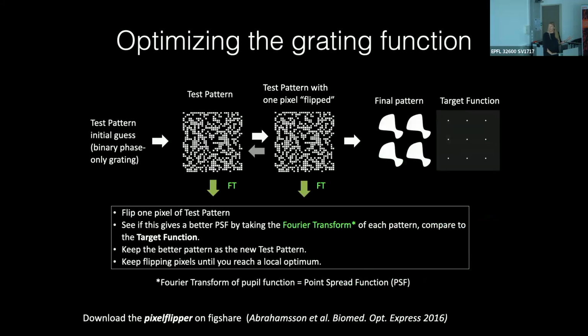The grating function here looks like that little goblet or little fan. People call it different things. It's made by the algorithm that I wrote. It's probably the worst code you've ever seen in your life. It's written in MATLAB by a grad student who doesn't like programming. So it took actually 5 days to run on my old plastic Mac laptop. It's much faster now that my student has rewritten it in vectorized form without for loops in MATLAB. I recommend doing that, but it really works quite nicely.